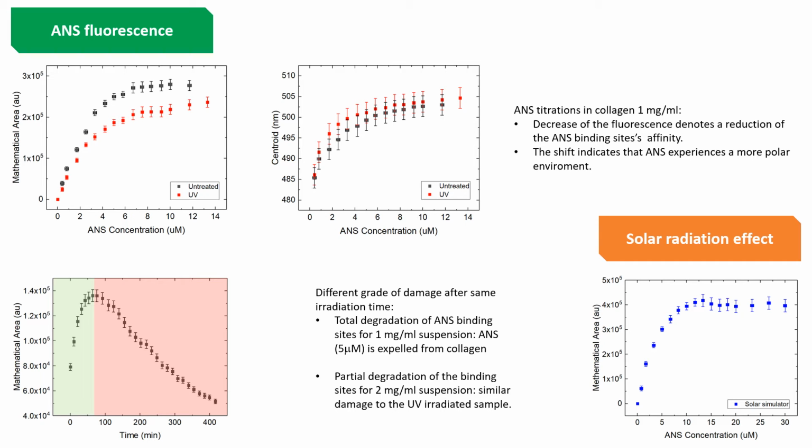While for the 2 milligram per milliliter, we were able to do a titration, and we obtained results similar to the ones seen before for the UV treated sample.